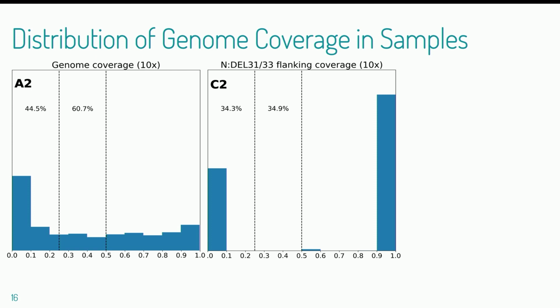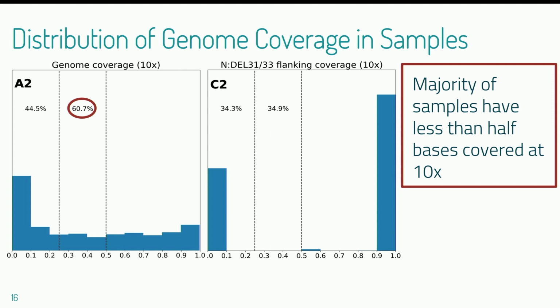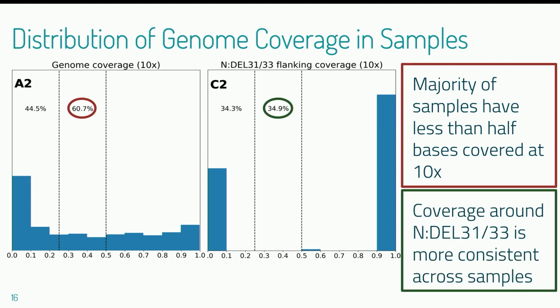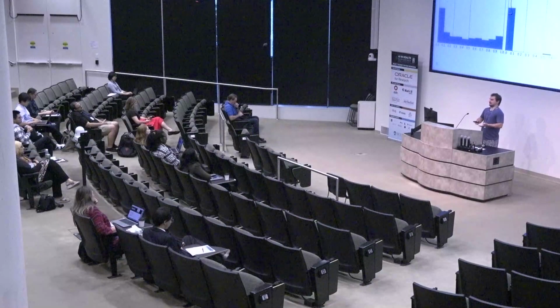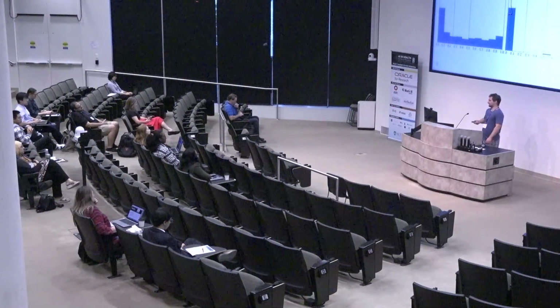Also, just to bring back the point about the deletions, the majority of the samples we work with have poor coverage. Again, environmental degradation. However, the region around the nucleocapsid gene is pretty well preserved. Again, this is a data-based pattern, but that gives us more confidence that this marker is actually a useful marker, because empirically, this region tends to be less degraded in the data we have, and since we have a marker there, we're more confident in making these Omicron calls.